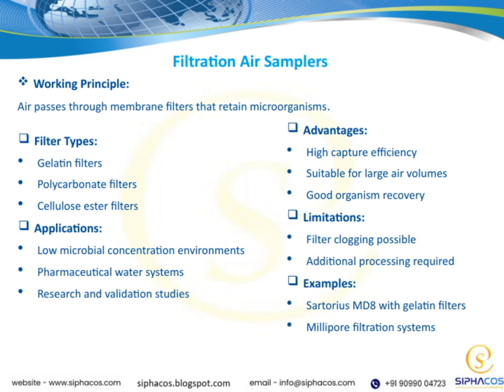The working principle is straightforward. Air is drawn through membrane filters that trap microorganisms on their surface. This allows for easy collection and subsequent analysis of the microorganisms present in the air sample. Overall, this technique is a powerful tool in air quality monitoring, especially when combined with the right filter type and system for your specific needs.